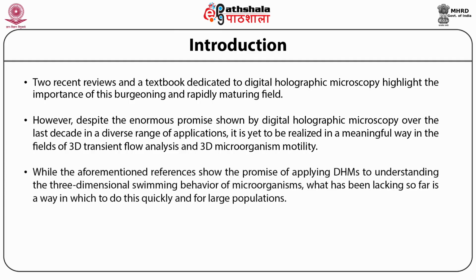While the aforementioned references show the promise of applying DHMs to understanding the three-dimensional swimming behavior of microorganisms, what has been lacking so far is a way in which to do this quickly and for large populations.